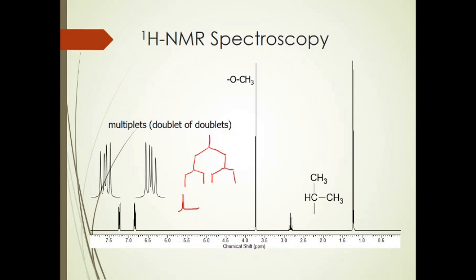And then your spectrum is that. And so this is referred to as a doublet of doublets because you have two neighbors, but they are splitting that one hydrogen by different coupling constants, and so you get different spacing. Again, if you don't follow this, it's not important.